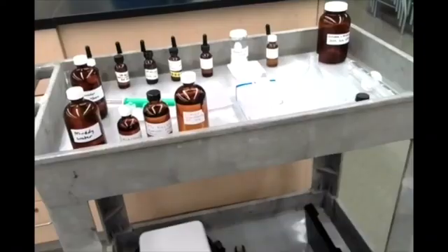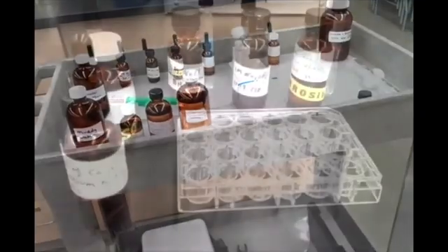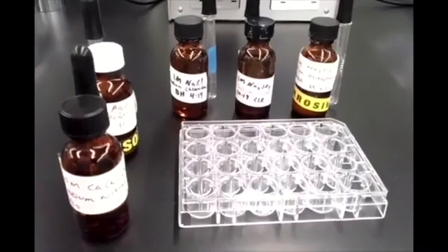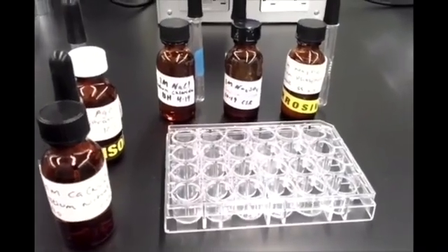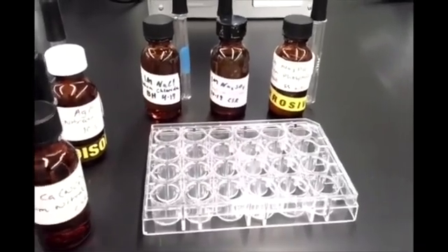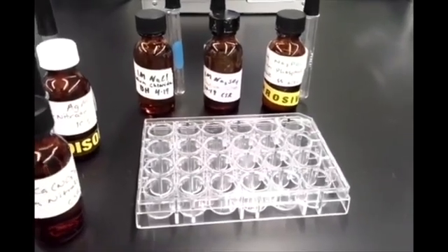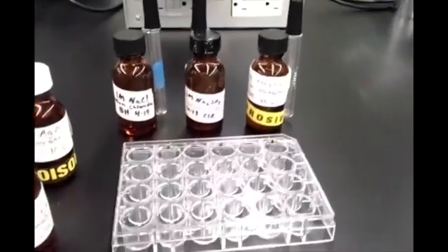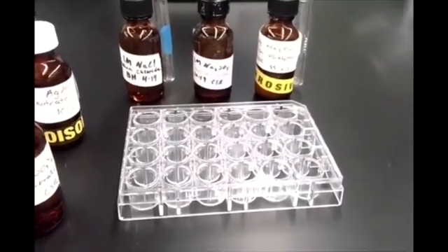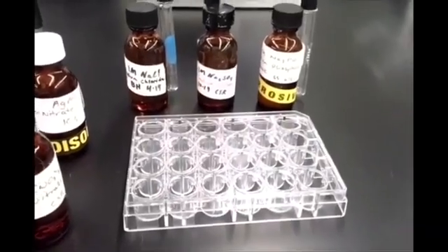In this lab, we're going to look at some reactions involving salt solutions, as well as the properties of said salt solutions. In this first part of the lab, we're going to combine some salt solutions and look for the formation of precipitates. So basically, I'm going to add a couple of drops of each solution into this sort of well plate, and so you can see the reaction that happens, or in some cases doesn't happen, inside these wells. Okay, so with the dark background of the benchtop, hopefully if any precipitates form, you'll be able to see them.